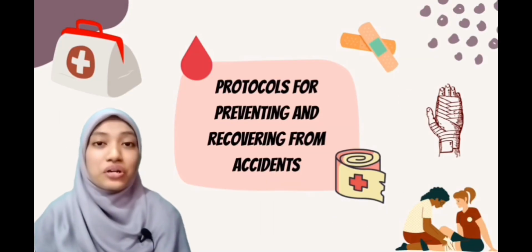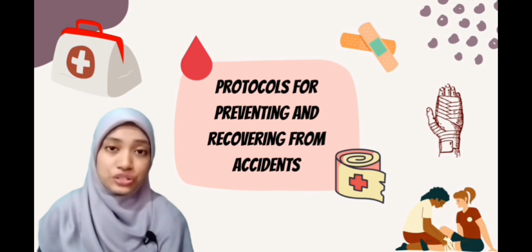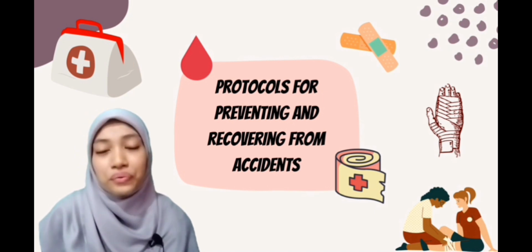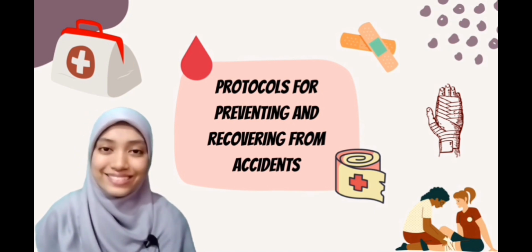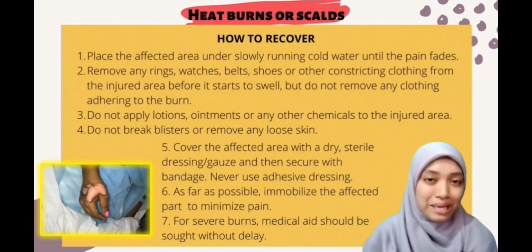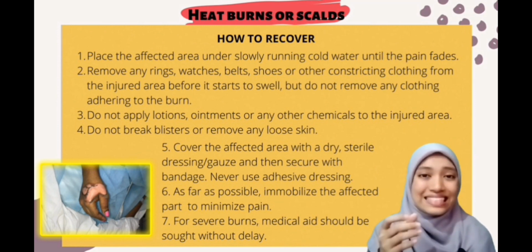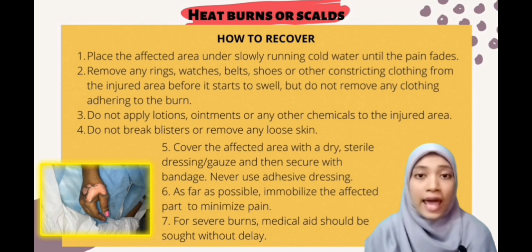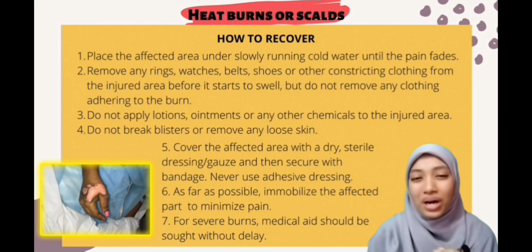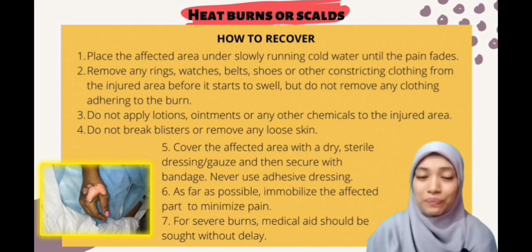As a teacher, we also need to know about how to prevent and treat an injury or accident that occurs in the laboratory so that worse things can be avoided. For example, a teacher was conducting a lab class at school. Suddenly, one of his students is holding a very hot glass container and causing his hands to scald. So, what action should he take to treat his injured student?